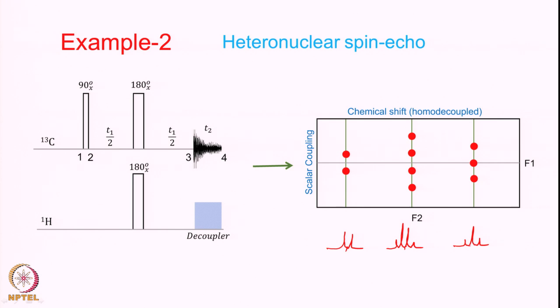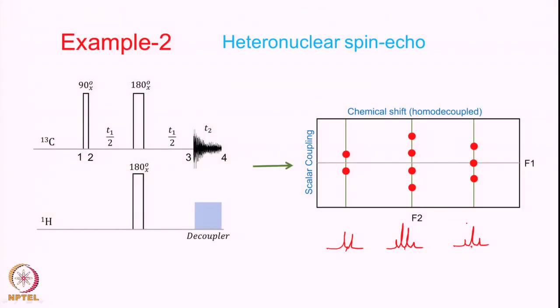Now the chemical shift will be in the middle again, and it will fall on the line in the center. So this is the way you separate out the interactions. It is as though we have rotated the whole multiplet along the orthogonal axis. So you have put the multiplet structure along the orthogonal F1 axis, and the chemical shifts are kept along the F2 axis. And this is an extremely useful technique.